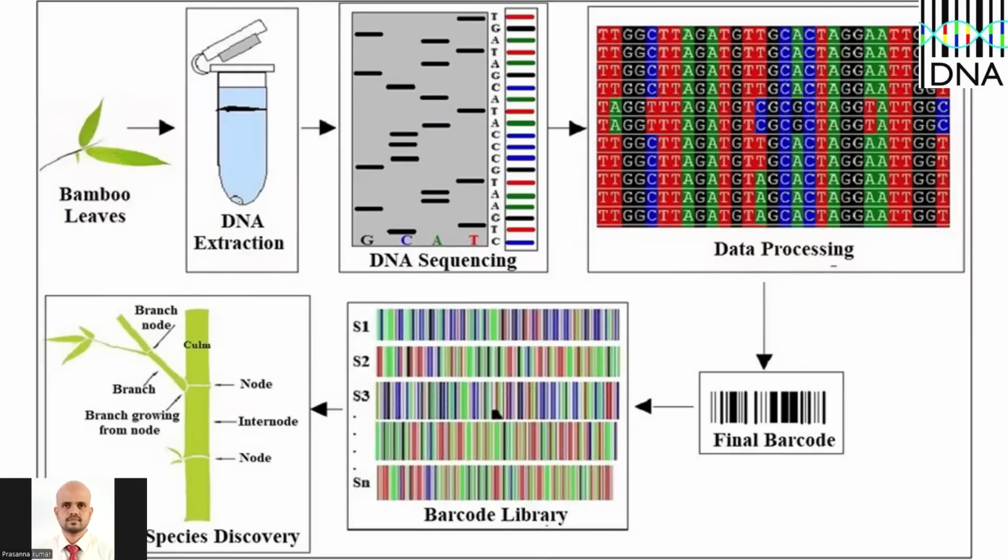Okay, so how does barcoding work? Let's say we have a bamboo species A. First, the conventional taxonomists identify the bamboo species, extract the DNA, do the PCR amplification, and sequence the barcode gene, like the RBCL or MATK gene here. Then they deposit the sequences in the database and get the accession number. Like a universal product code, you have a four-colored barcode here.